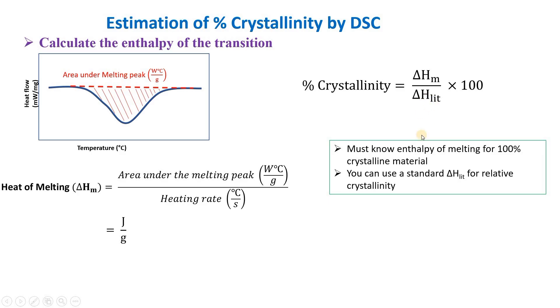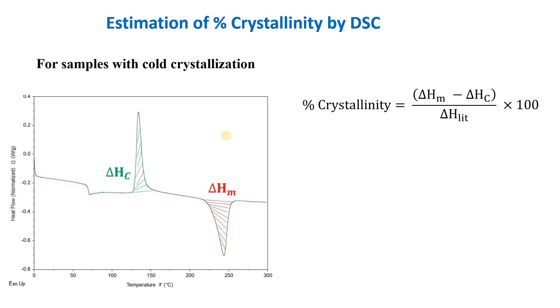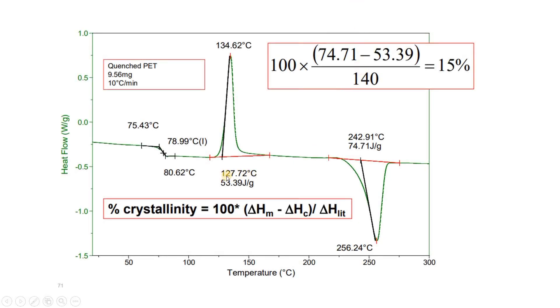If we observe a cold crystallization peak in the graph, we need to subtract the enthalpy of crystallization, because it will affect the delta H of melting. We subtract this value so that we get the correct percentage crystallinity when a cold crystallization peak is present.